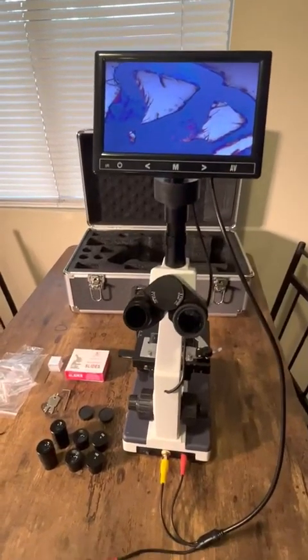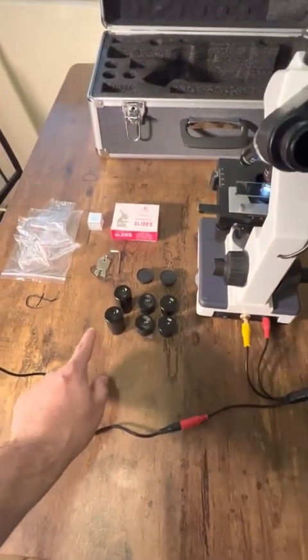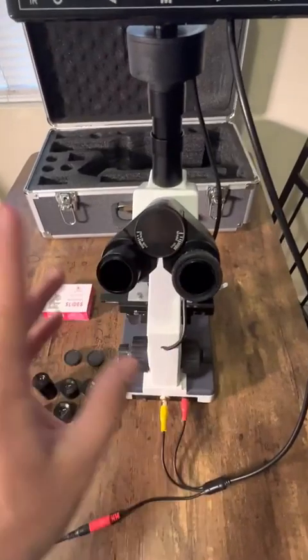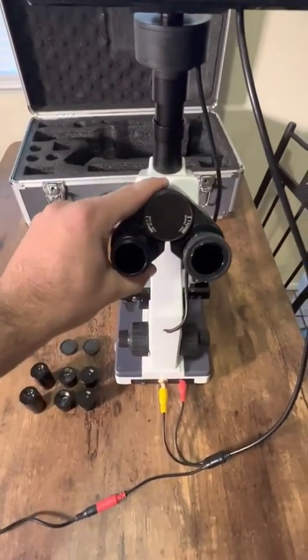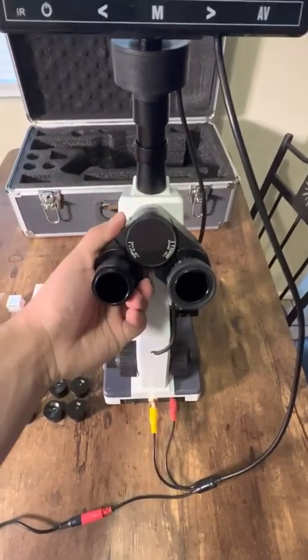Hello, here's a review of the microscope. It comes with a 16x zoom, 25x zoom, and a standard 10x zoom. You can put them both in here and look at each one with both eyes, adjusting it depending on where your eyes are.